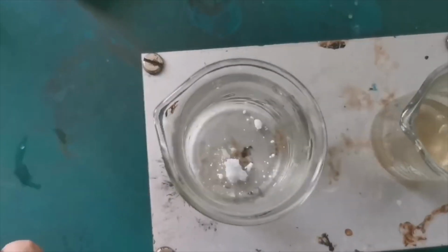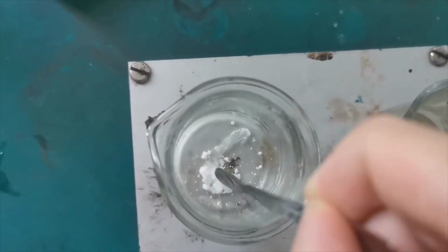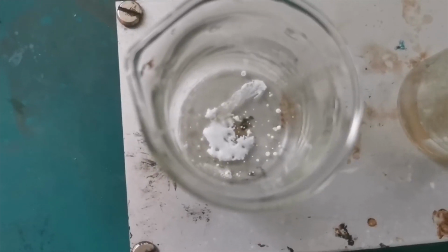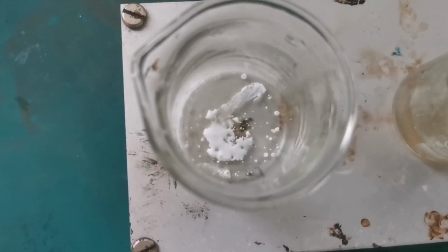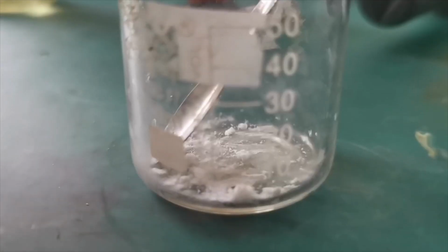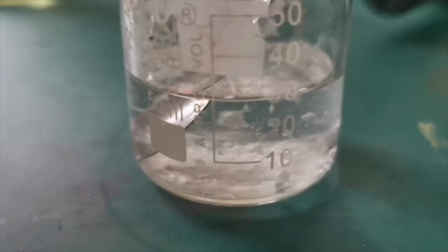To start, take around 0.1 grams of lithium chloride and dry it over a hot plate. This is very important since the reaction system must be free of water. When no more water vapor is given off, the beaker is removed from heat and allowed to cool a bit. Then around 30 milliliters of propylene carbonate is poured into the beaker. You can see that PC is a colorless liquid that resembles water.